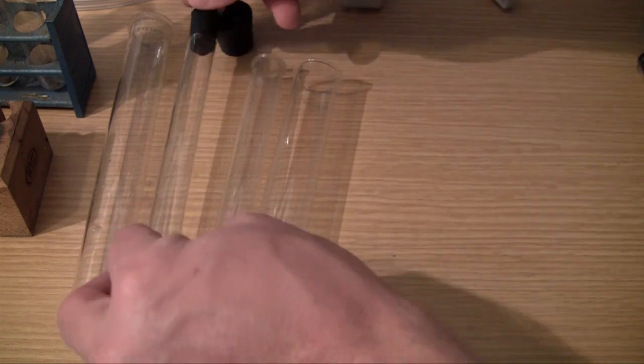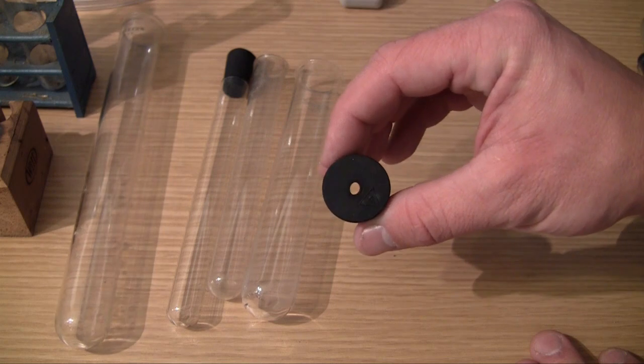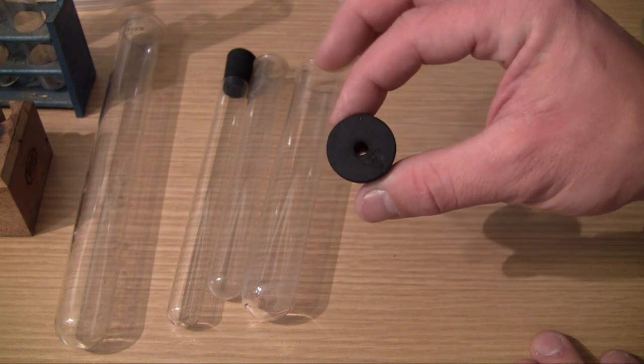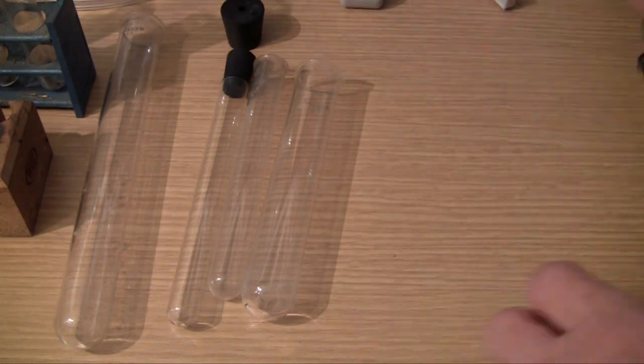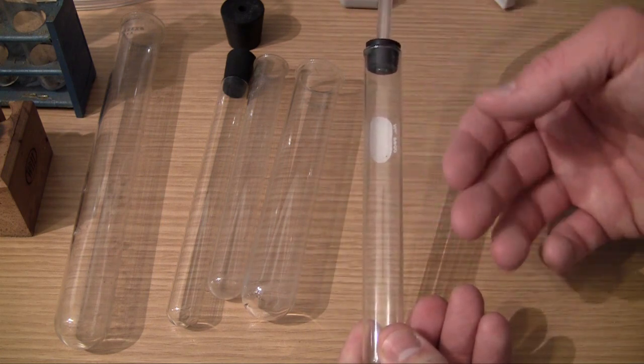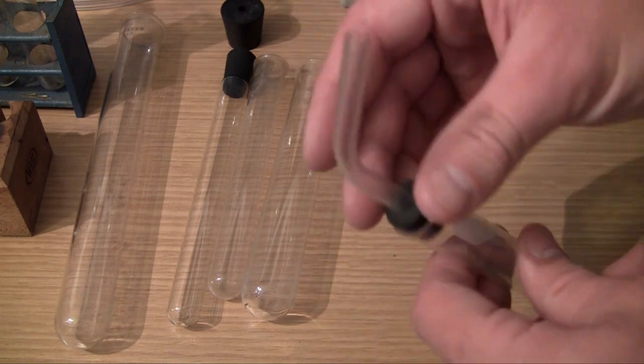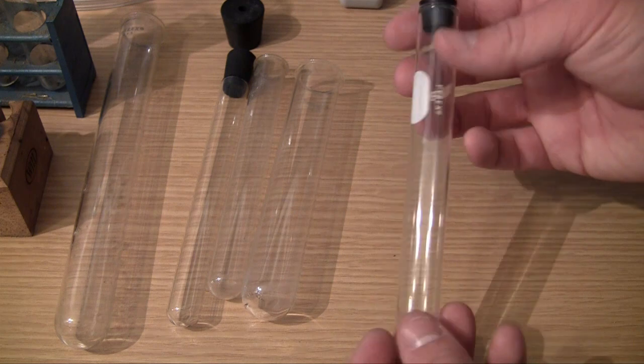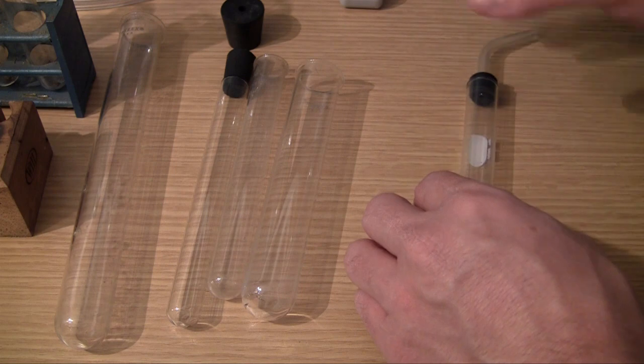And another thing that I would recommend getting is a rubber stopper with a hole in it, and actually you want to grab a couple of these. The reason that you would do this is not for storing samples, but sometimes we're going to be heating up chemicals and we're going to want to capture the gases or the fumes from the chemical reaction. So you actually use your rubber stopper with a hole and put a piece of glass or plastic tubing in there, and that is how you capture the gases from a chemical reaction.